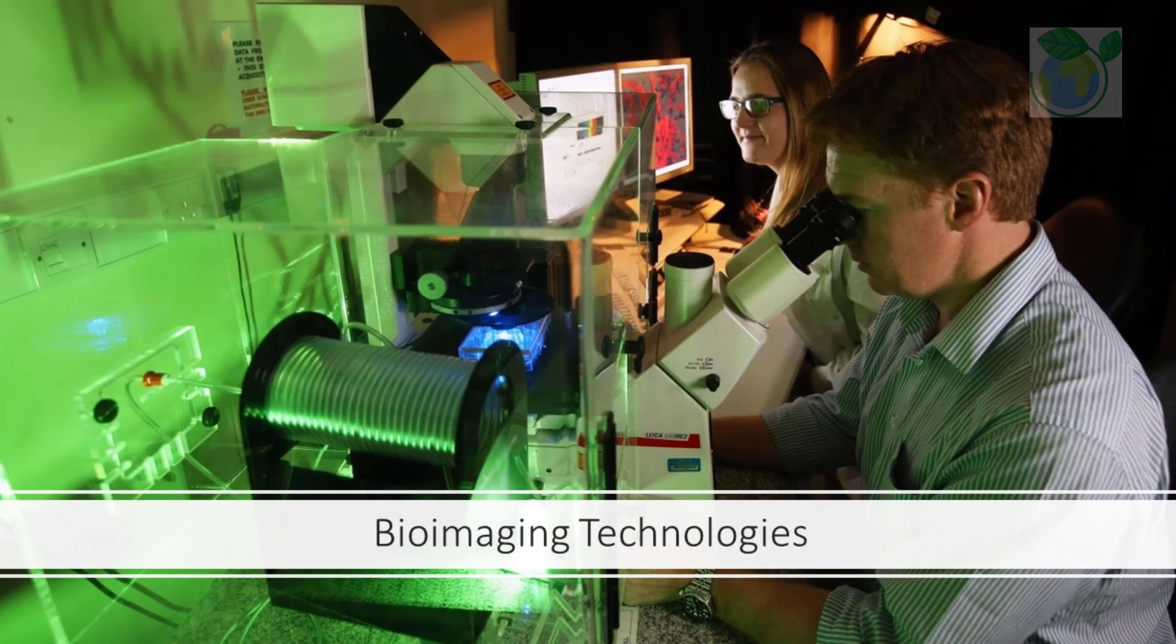Imaging equipment can also be bound up to software and require a significant amount of user training, presenting challenges for researchers unfamiliar with its operation. Given the large initial cost of having confocal systems, most universities or research institutions have a dedicated core facilities team to maintain the instruments and give instruction for use, which can give researchers access to and the confidence to use a wider range of equipment within the Bioimaging Research Center.